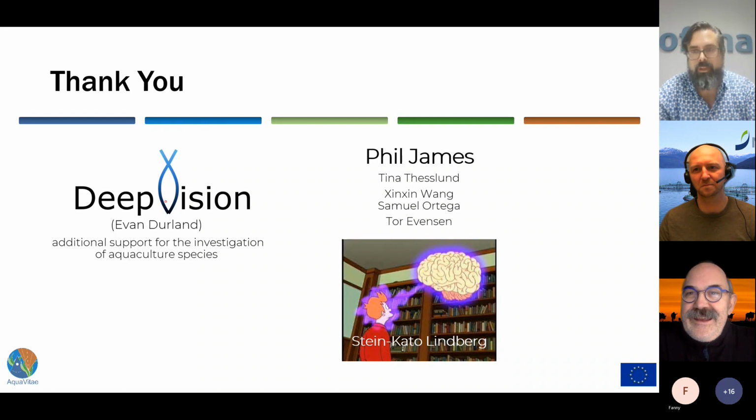Yeah, we did in our experiment, just to minimize the level of stress that the animals experienced too. We had a conveyor belt system, but we wanted to limit the time of the animals under scanning to a minimum. But we did UV, we did royal blue, and then we did regular light. The amount of data we have at this moment is massive. But I think it's a good idea to always double check at another light spectrum as well, to play devil's advocate. Perfect. Fantastic. Thanks. Thank you.